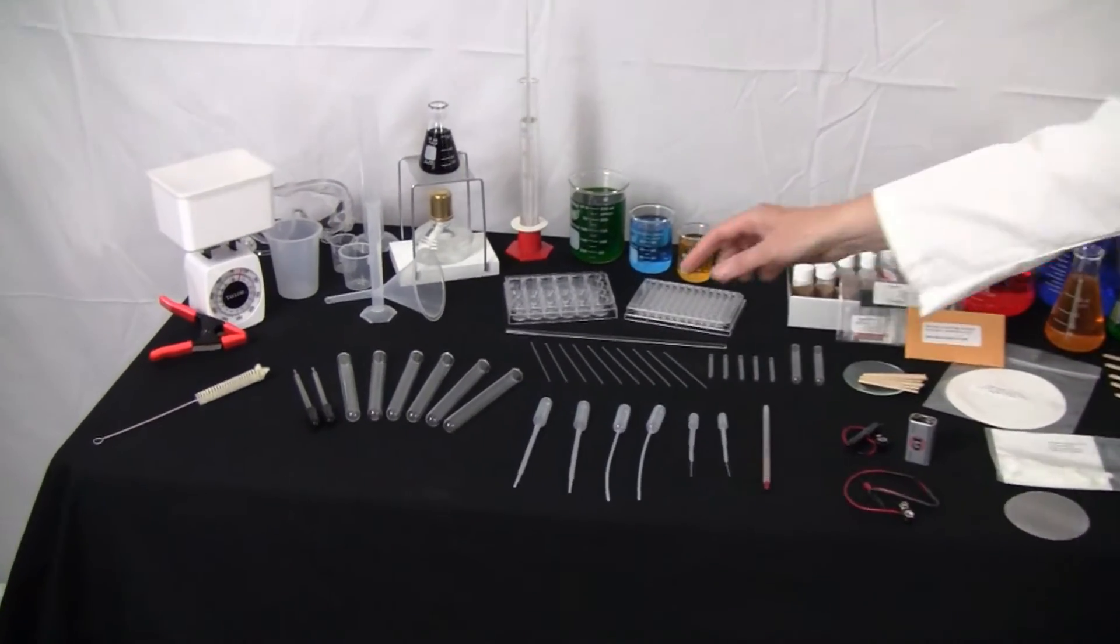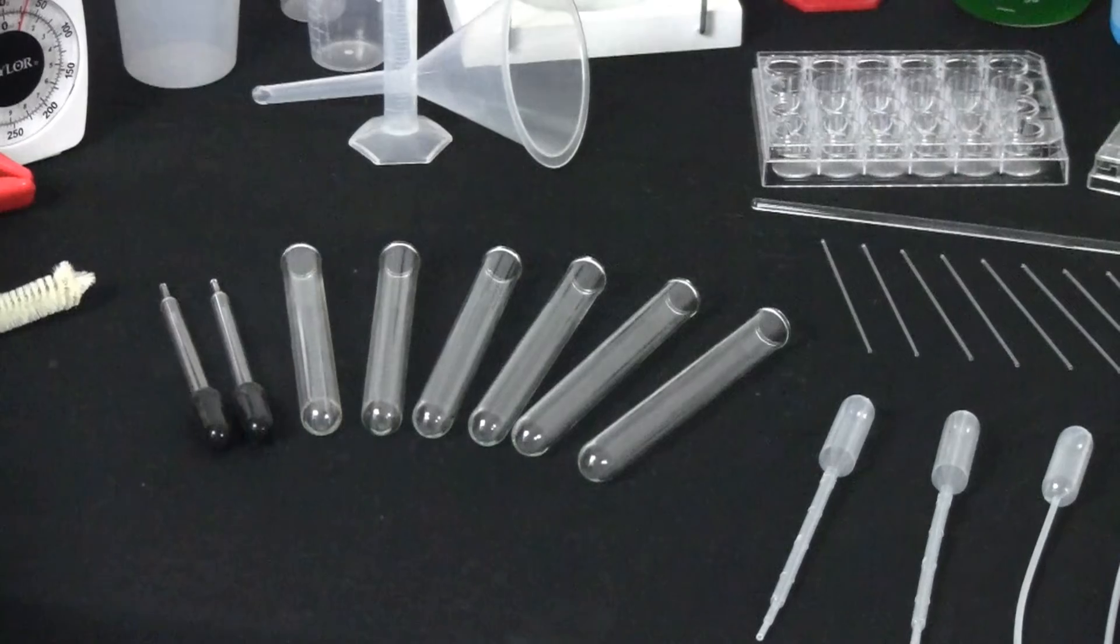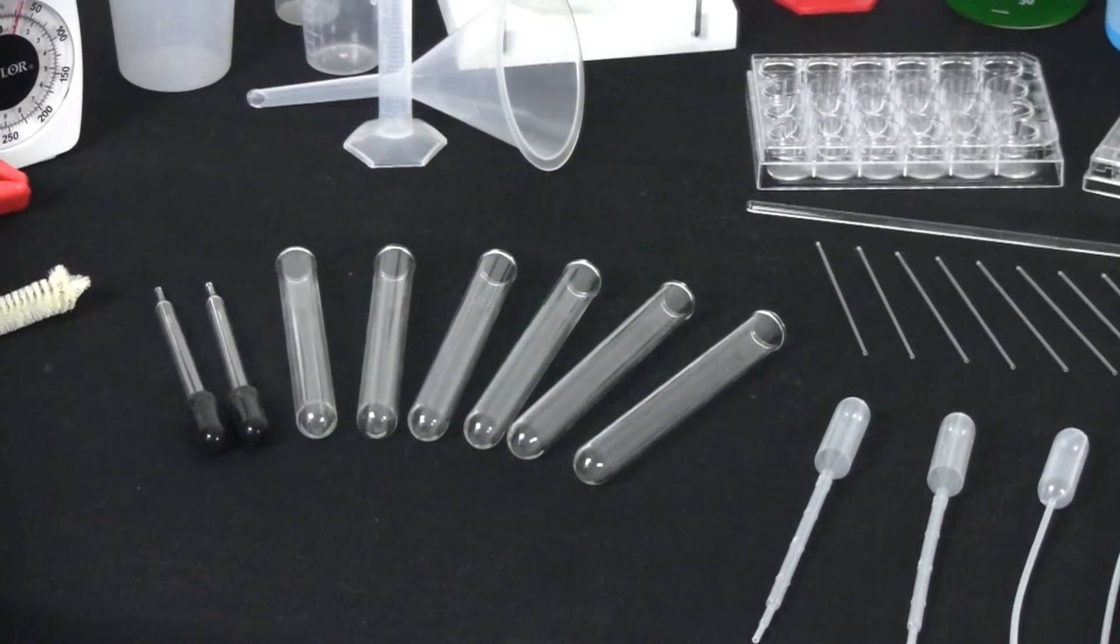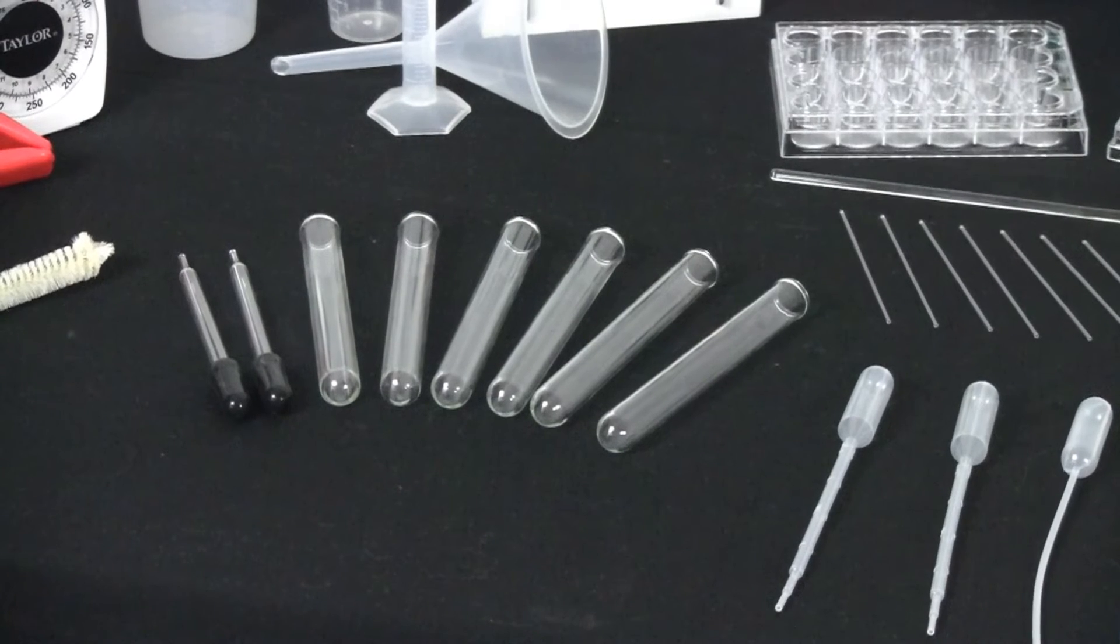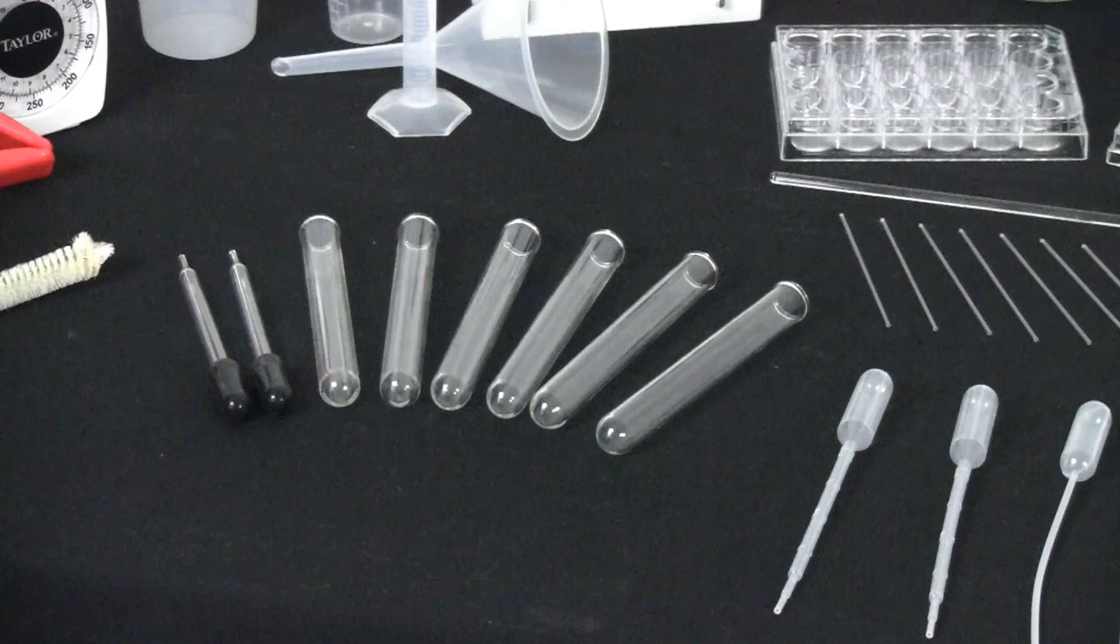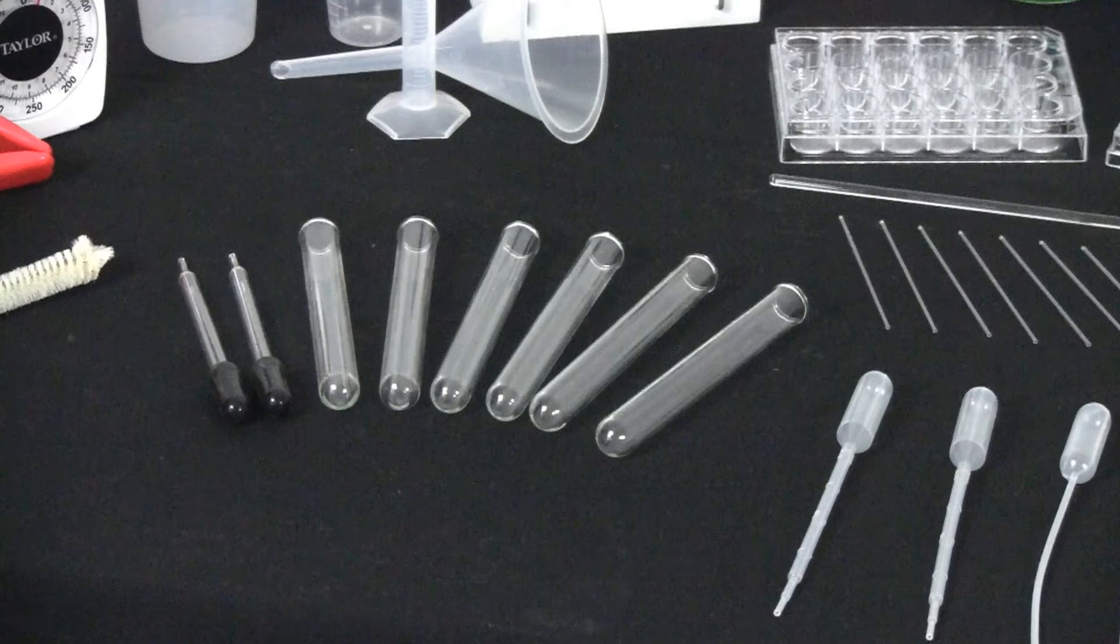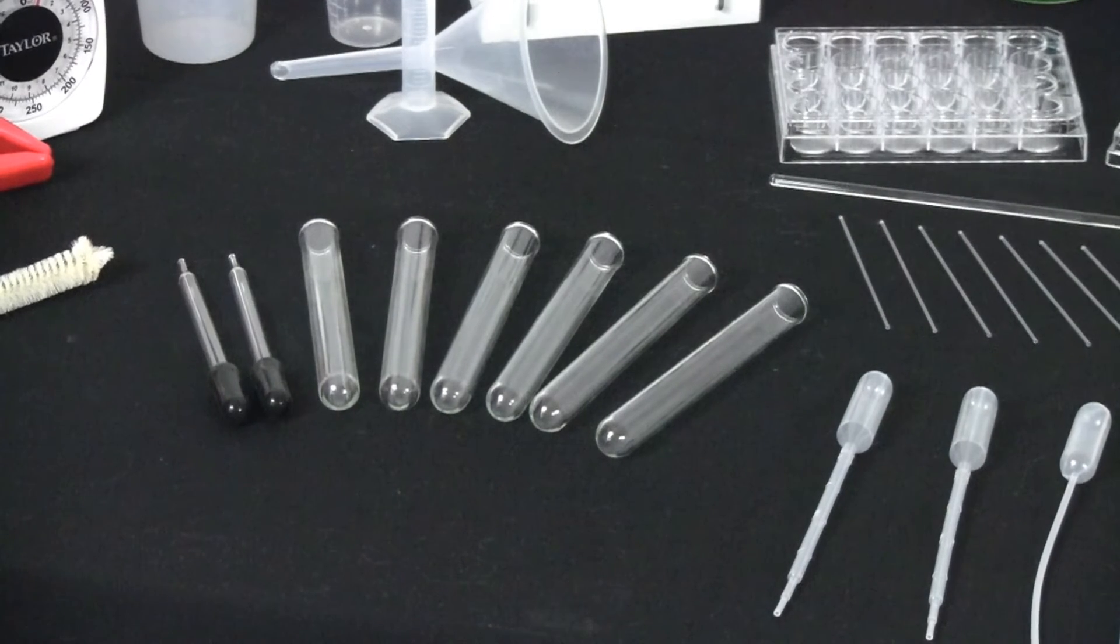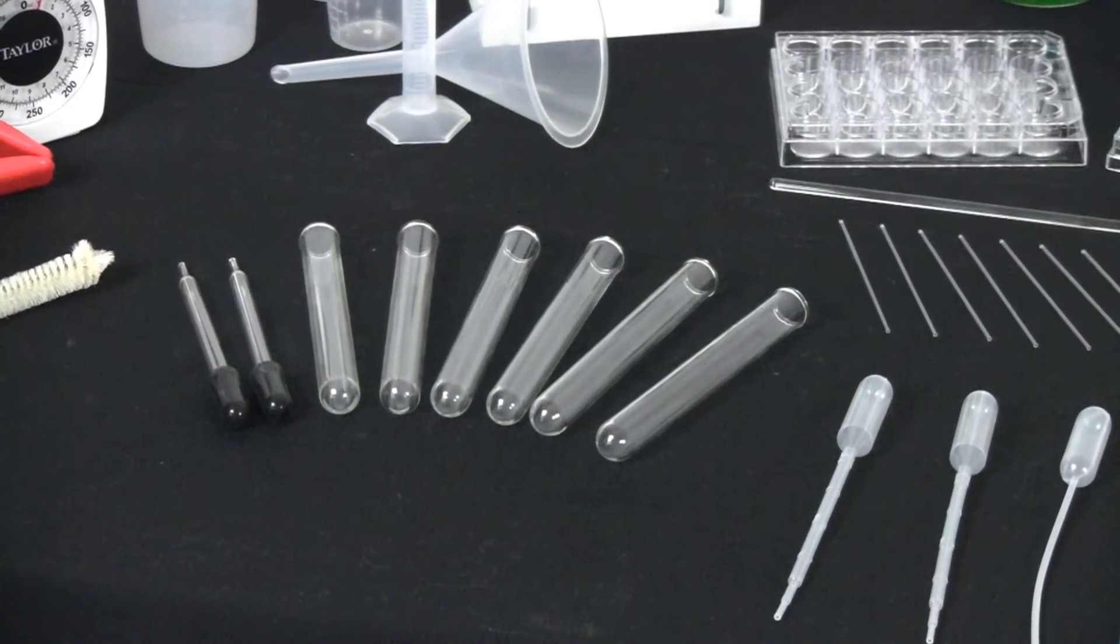The second thing we have is test tubes. So these test tubes are used for a lot of different experiments. They are glass cylinders with an opening at the top, and these hold and mix small amounts of chemicals, and you can put them in a rack. Now one way to make a rack is to have a block of wood and to drill large holes into it, and then you can place them into a rack like that.